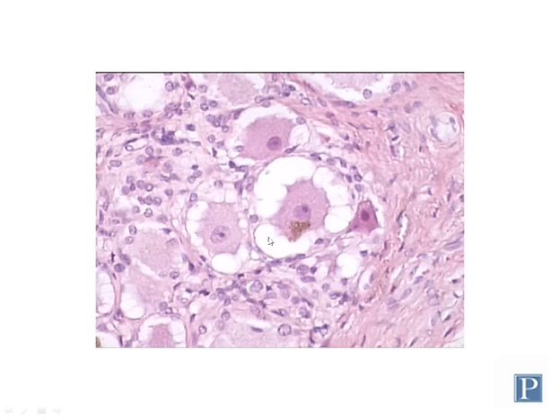Now, again, you can see another artifact here. You have this apparent space here between the satellite cells and the cell body of this neuron. In fact, normally this would be filled with the cytoplasm of the neuron, but these neurons tend to shrink back a little bit as a result of the staining protocol, and it leaves behind these little spoke-like structures which are called neurokeratin. And again, these are an artifact of slide preparation. These result from intermediate filaments protruding out of the cytoplasm, and normally that structure would not appear.